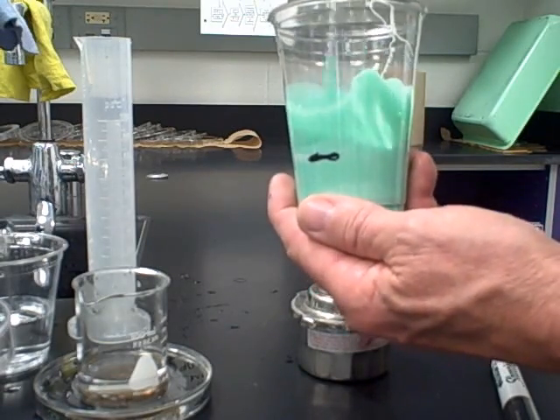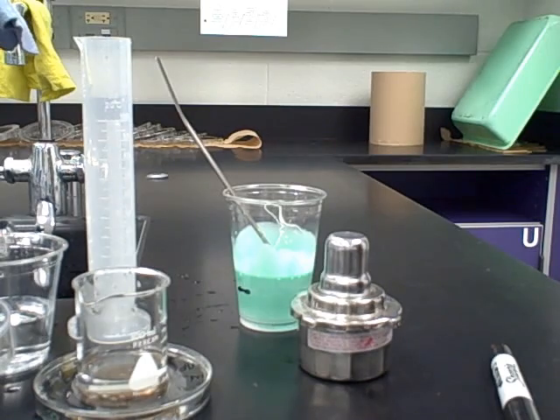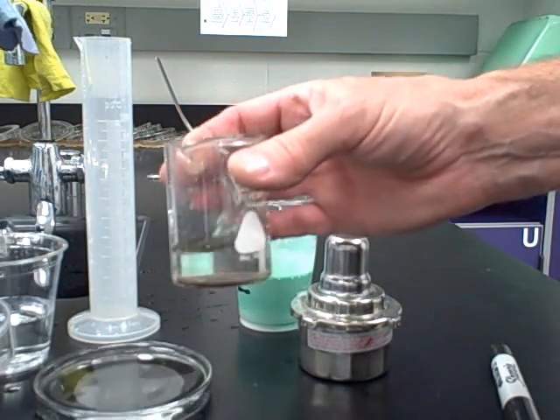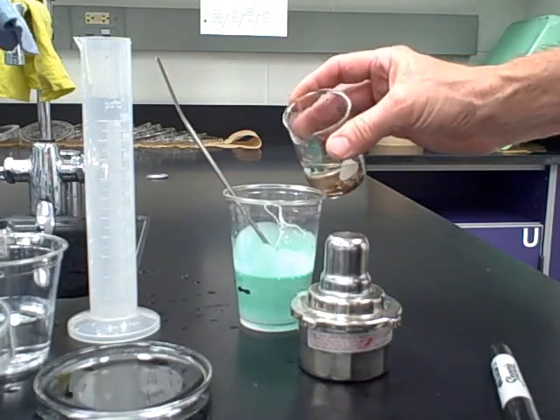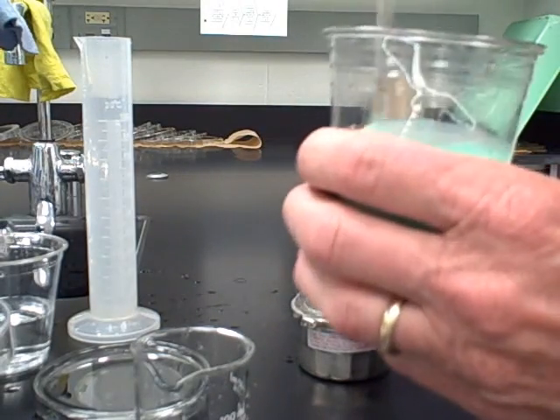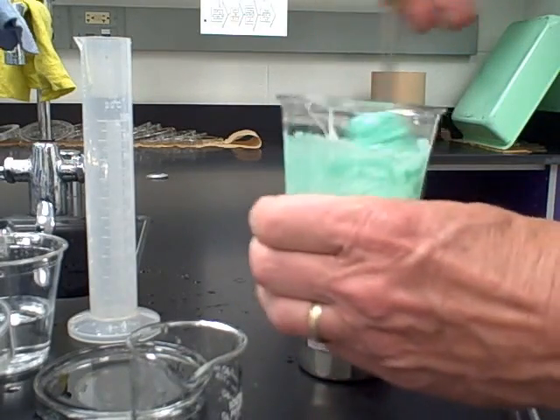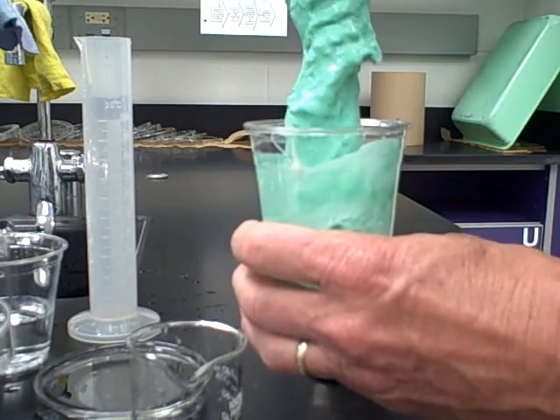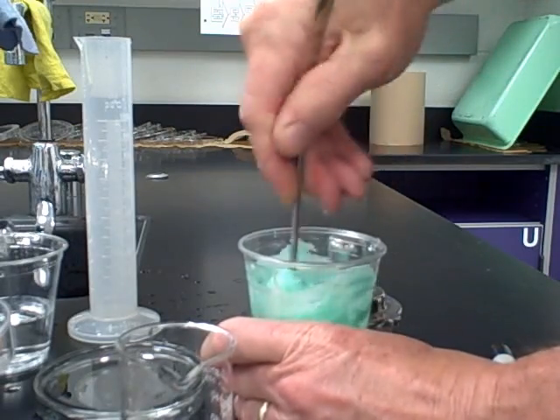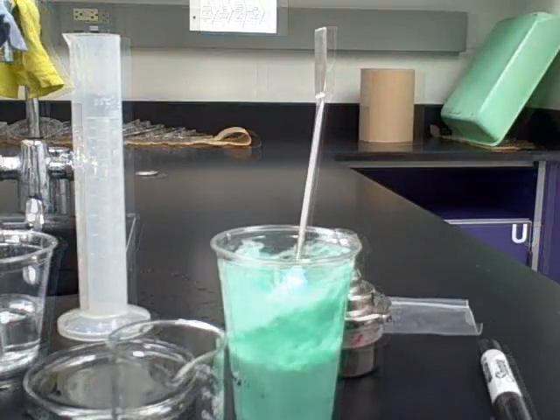This is the critical step where the chemical reaction occurs. Take the borax solution, which should be nice and cool now so you can handle it without tongs, and pour it into the glue mixture. Stir to cause the cross-linkers to react with the polymers of the glue. What you get is an amorphous solid. Keep stirring until almost all of the liquid has been absorbed.